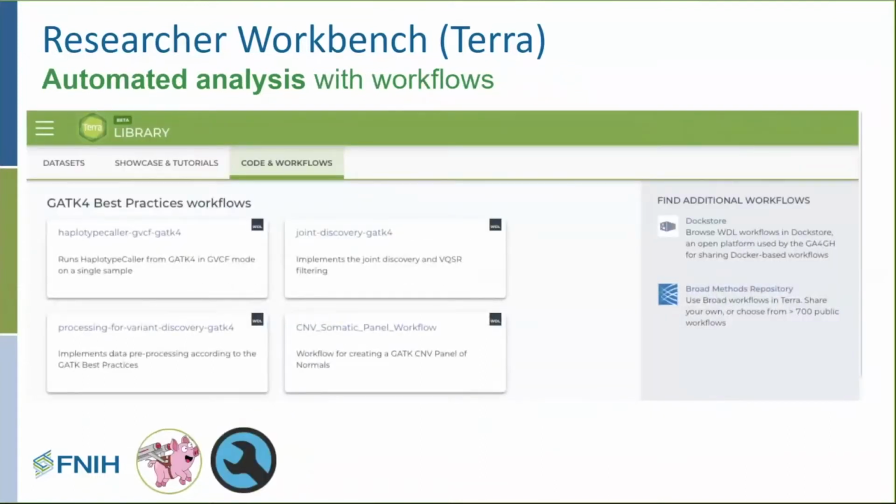So another analysis tool in the Terra Workbench is automated analysis with workflows. So workflows are pipelines. They are batch submissions by Terra's Cromwell execution engine to the Google Compute in the cloud. They're often used for preparing and processing genomics data. For example, aligning reads and calling variants.